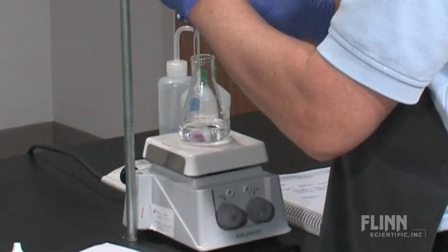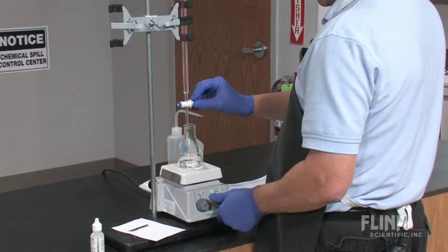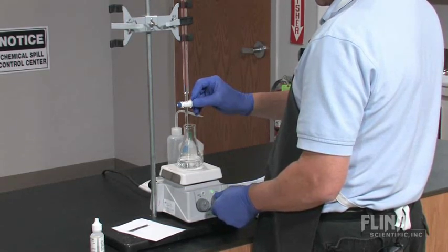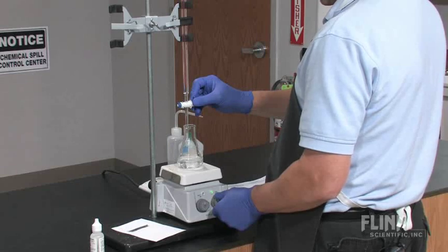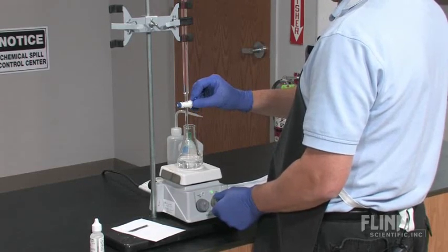Use a burette to deliver a stream of titrant within a couple of milliliters of your expected endpoint. You will see the indicator change color when the titrant hits the solution in the flask, but the color change disappears upon stirring. For best results, you may use a magnetic stirrer, but it's not necessary. If a magnetic stirrer is not available, you will need to use a swirling technique.